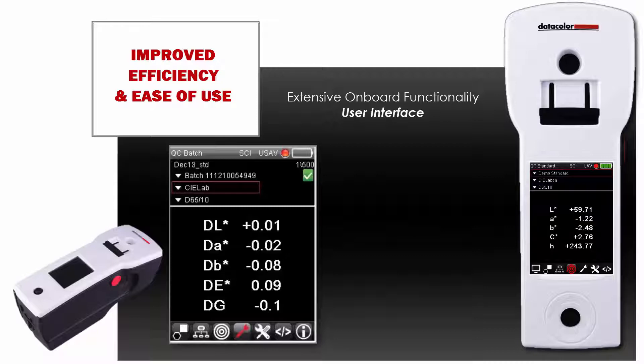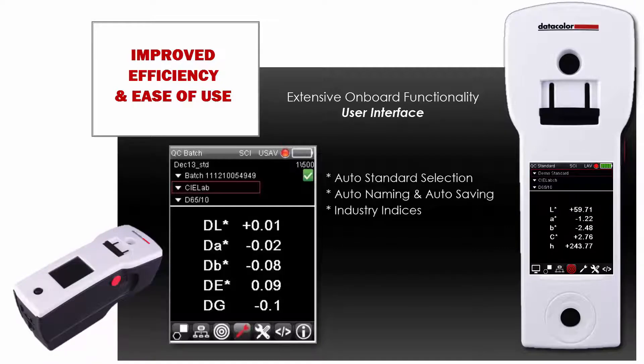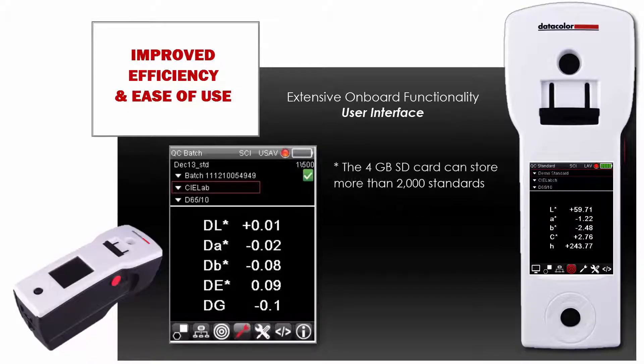Other important functions that will save time and enhance portability are auto-standard selection, auto-naming, and auto-saving, plus a wide variety of industry indices. The 4GB SD card can store more than 2,000 standards.